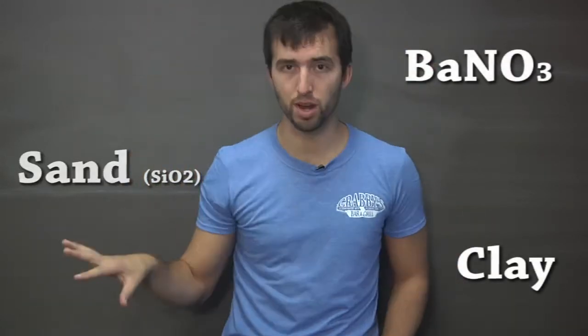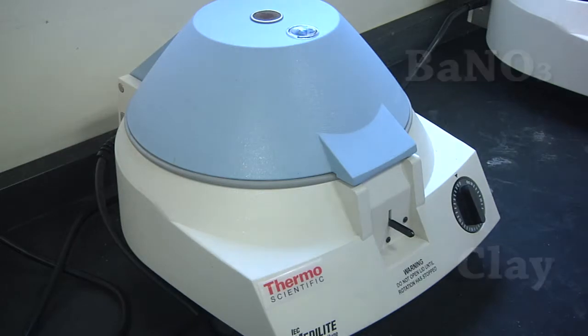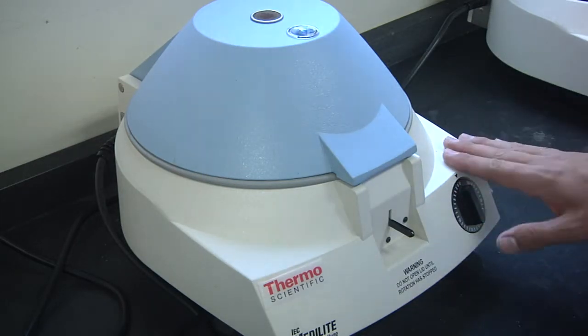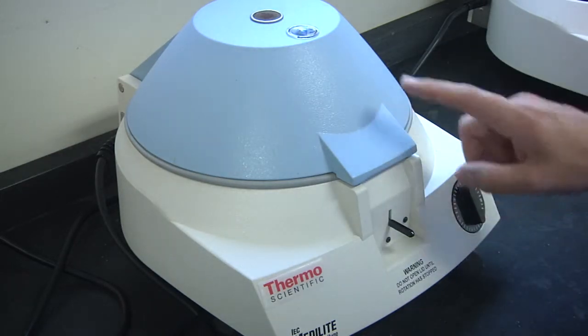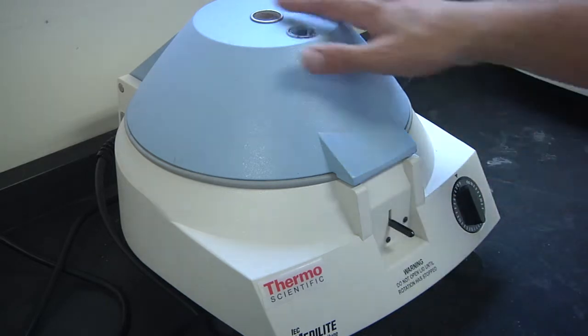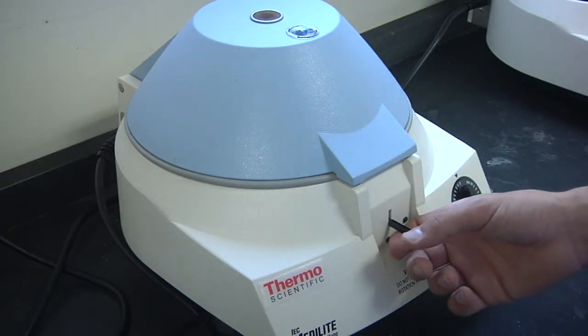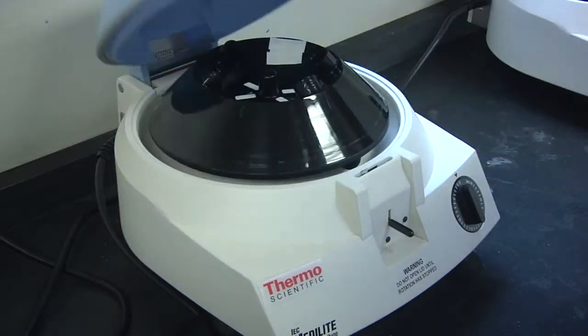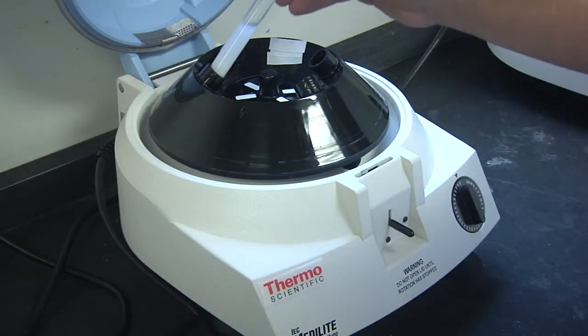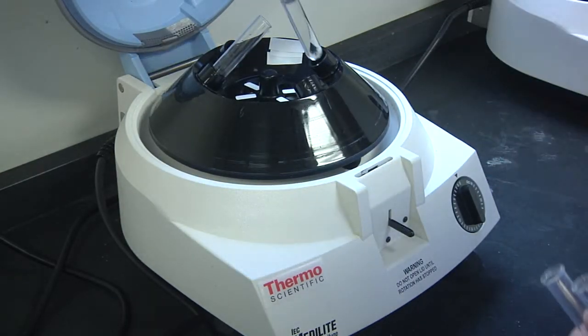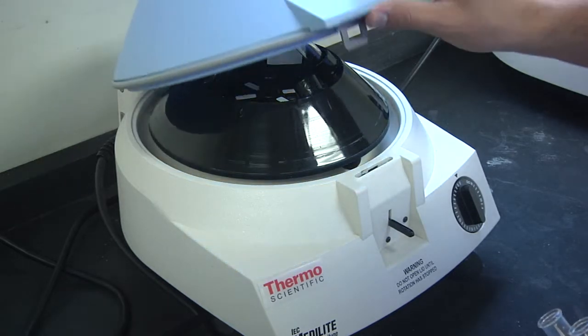Before using the centrifuge, we have to learn some basic rules about it. The first thing is: never open the lid until the rotation has stopped. To open the lid, merely pull up on this lever and open the hatch. You can insert your sample into one of these holes, but you have to be careful that you can actually close the lid. In this example, we cannot close the lid.